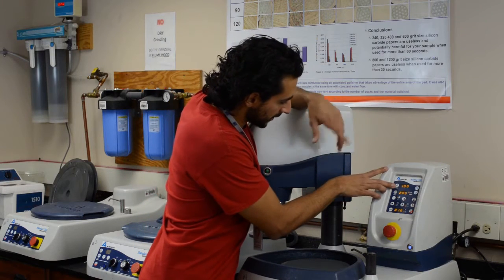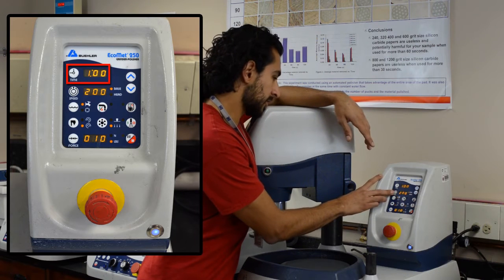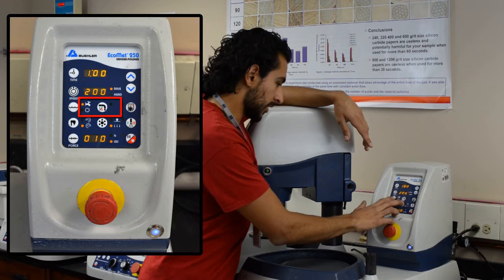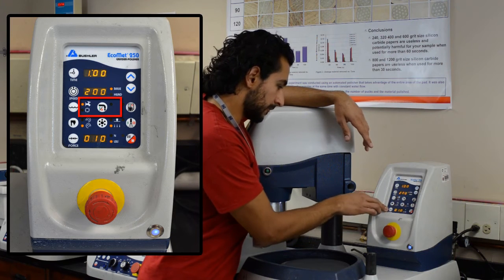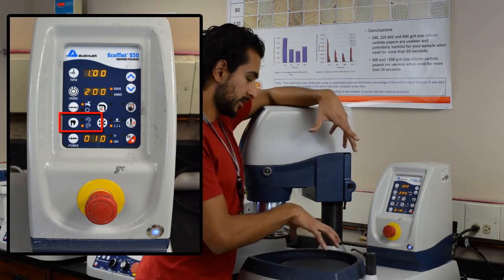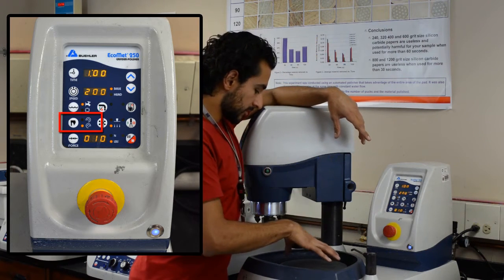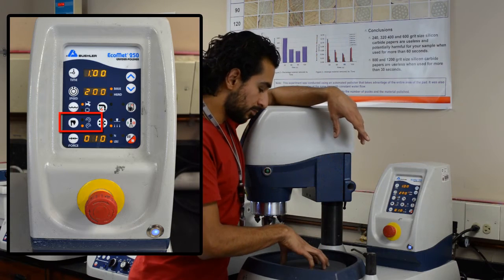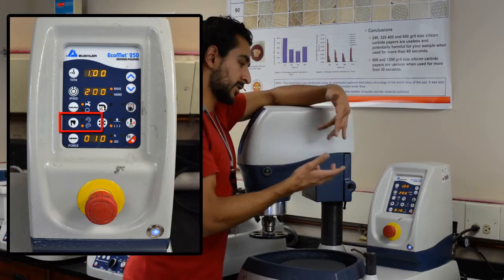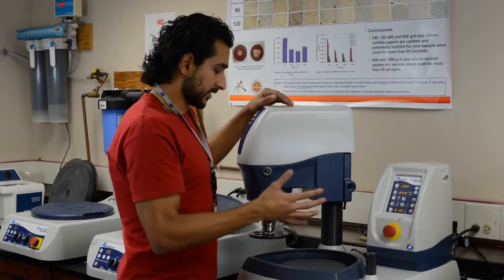So the settings for silicon carbide sandpapers are: time is one minute, base speed at 200 RPM, head speed at 30 RPM, water running, maximum force at 10 pounds, and you want the head and the base to rotate in opposite directions. You could make them rotate in the same direction, but opposite directions is fine. And that's it — you're ready.